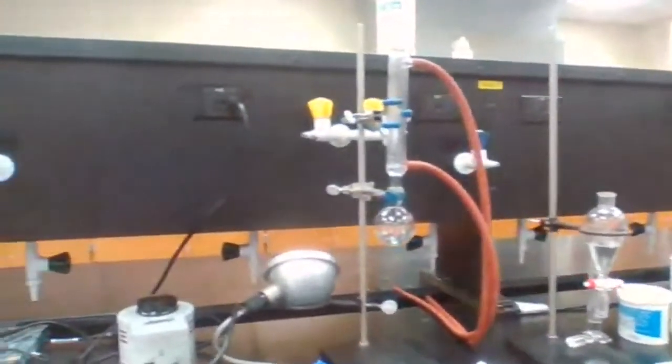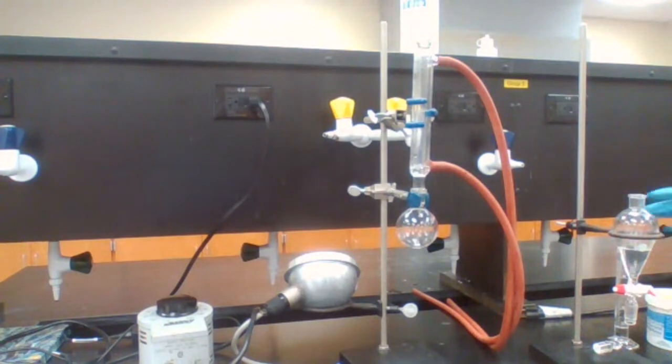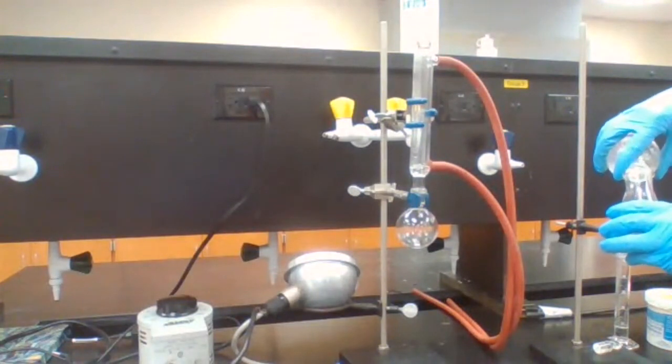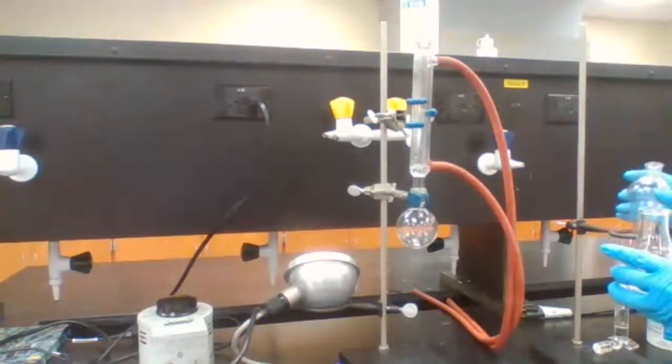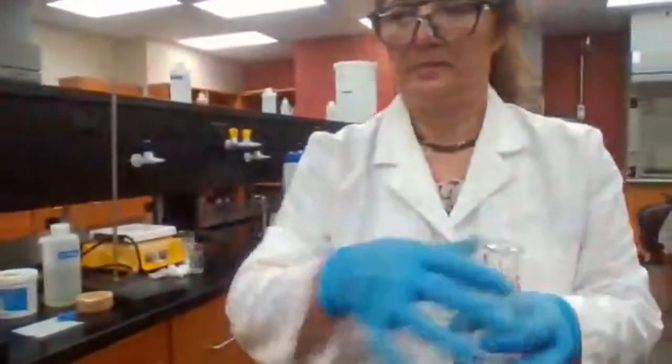Next step, transfer the organic layer into a beaker, right? Or an Erlenmeyer flask. Transfer to the flask. We transfer the ether layer from the top because the bottom layer has more moisture. We try to avoid transferring the aqueous layer.